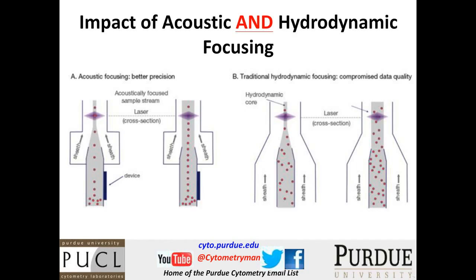And that's fine when you're going reasonably slow, but the powerful advantage of the combination of acoustic focusing and hydrodynamic focusing is that if you decide to move this system at high speed, then this is where the real advantage is, and I'm going to spend some time talking about that.